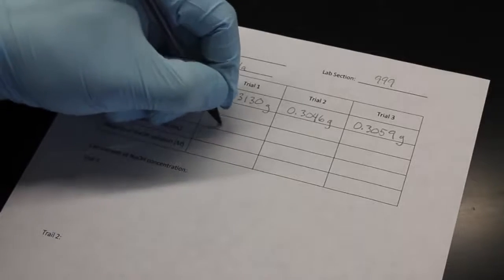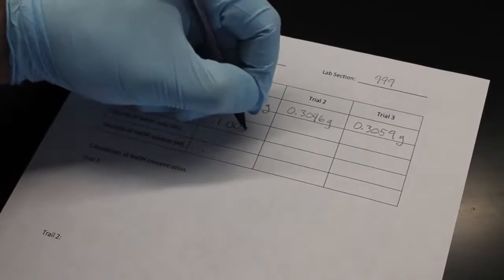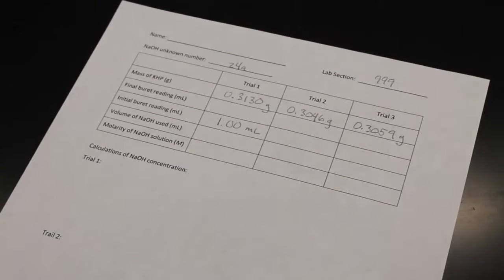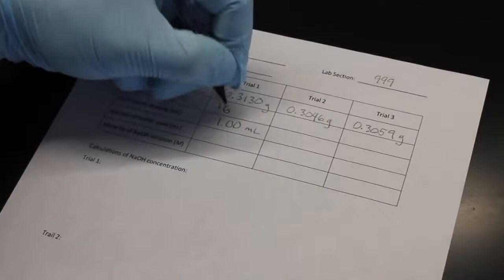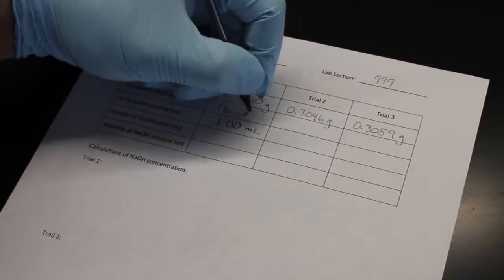The burette I was using had marks for every 1/10 of a milliliter. We can tell if our volume falls between these marks, so we need to document our volumes to the nearest 100th position. This is the proper number of significant figures for this piece of glassware.